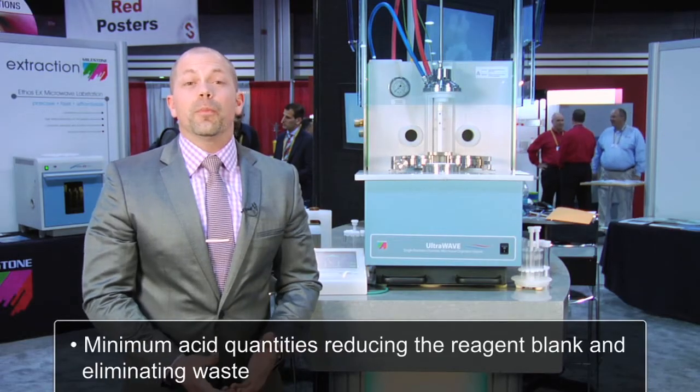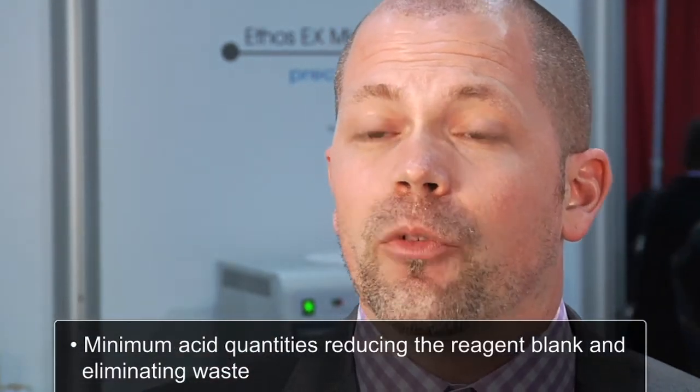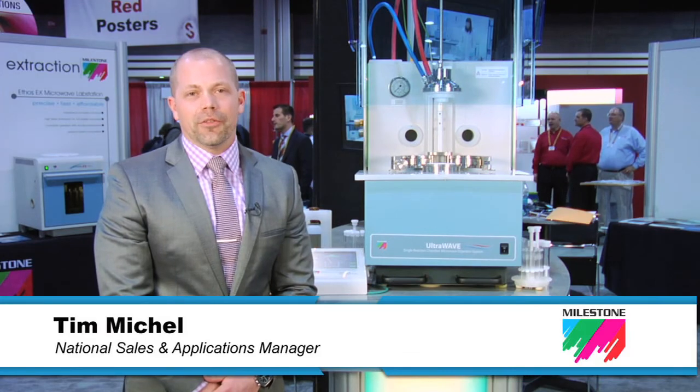In the UltraWave, we can use minimum acid quantities, which greatly reduces the reagent blank as well as eliminates waste. I'm Tim Michael from Milestone. Thanks very much for your attention.